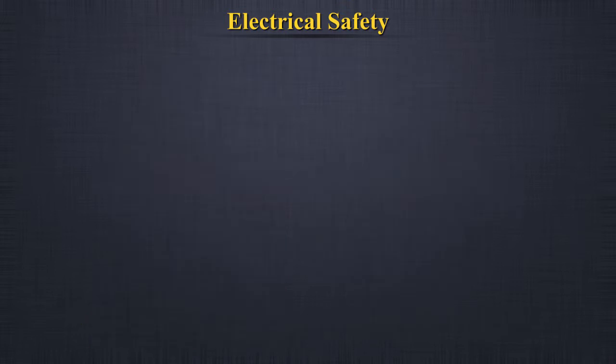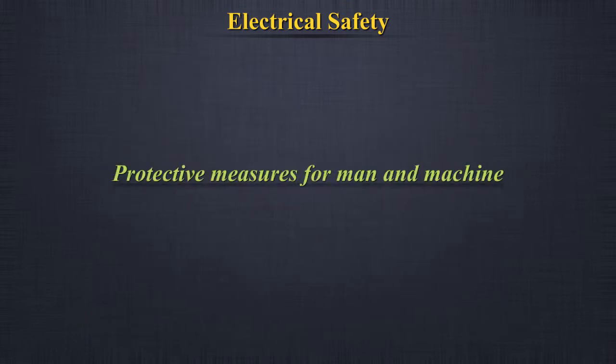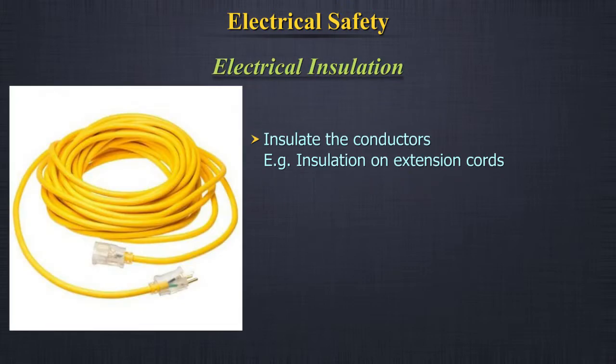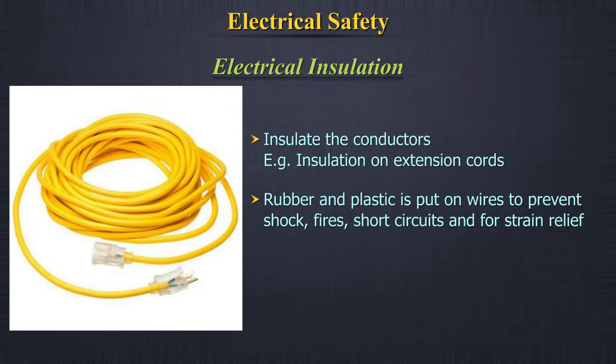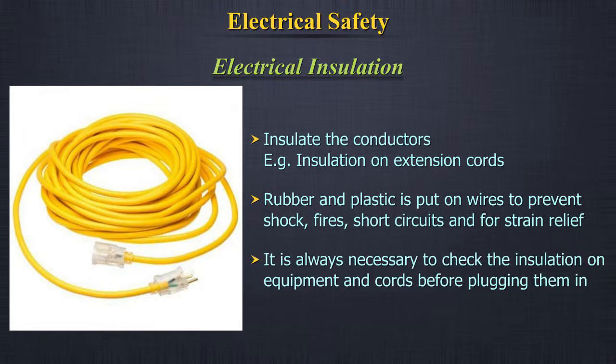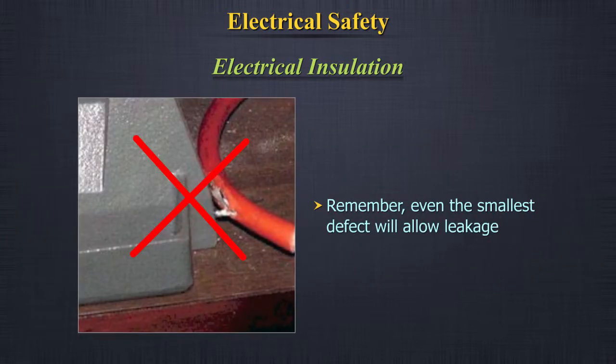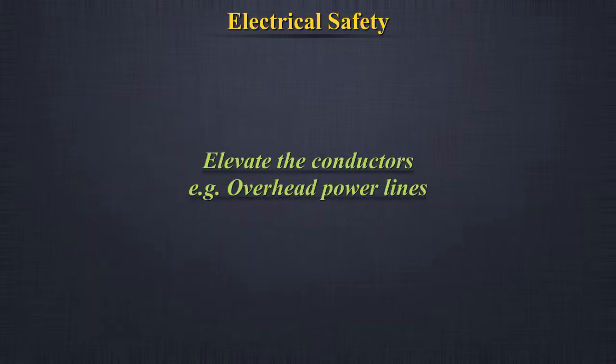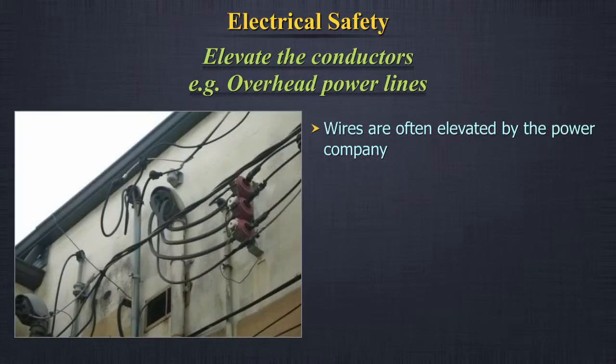Specialized refrigerators must be used when storing chemicals that have explosion potential. Protective measures for man and machine — electrical insulation: insulate the conductors. For example, insulation on extension cords; rubber and plastic is put on wires to prevent shock, fires, and short circuits, and for strain relief. It is always necessary to check the insulation on equipment and cords before plugging them in. Even the smallest defect will allow leakage.